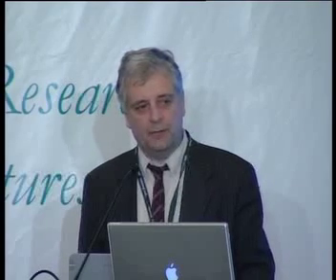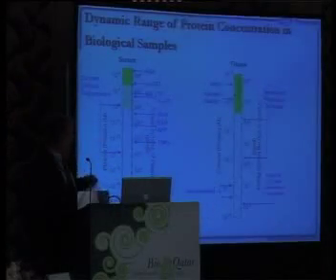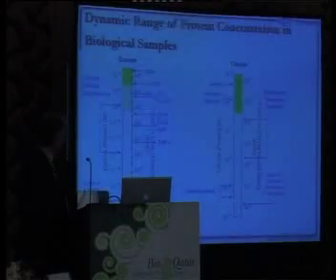The key, and I'll ask this question over lunch, the key is getting down into the deep proteome if you're looking for biomarker studies, and there's several ways you can approach that. First of all, this is the dynamic range of proteins within tissue and within serum, and you can get rid of the very common proteins using chemical methodologies, which we've been looking at very closely, to get down into the deep proteome, which is where the interest is.